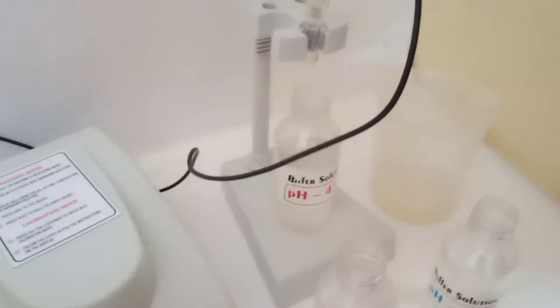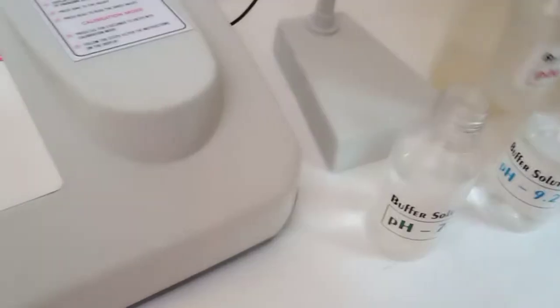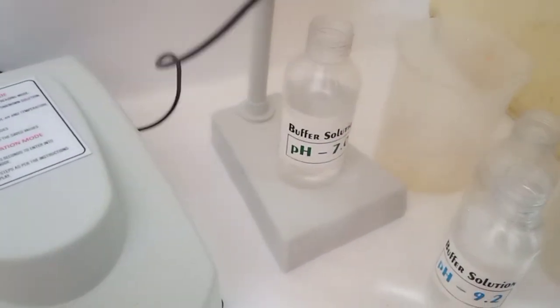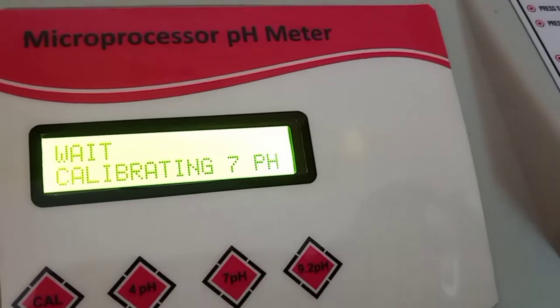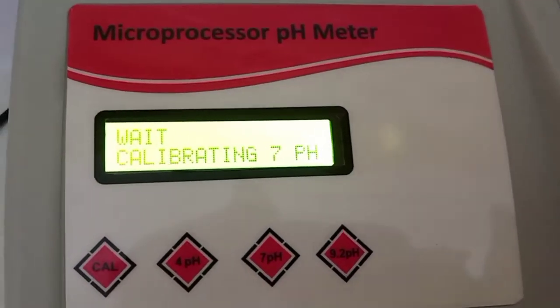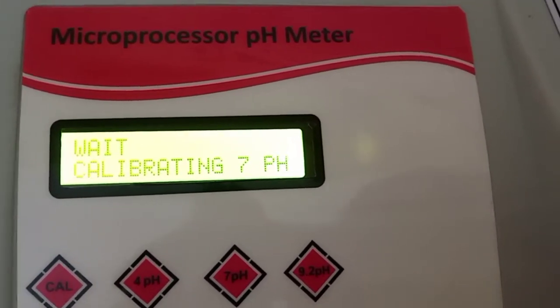Remove the electrode from the 4 pH buffer and wash it thoroughly with distilled water. Now put the electrode into the 7 pH buffer.